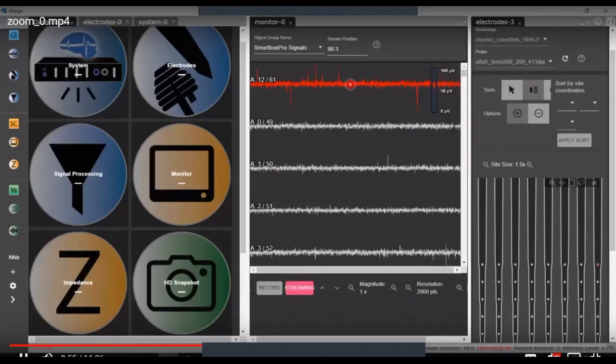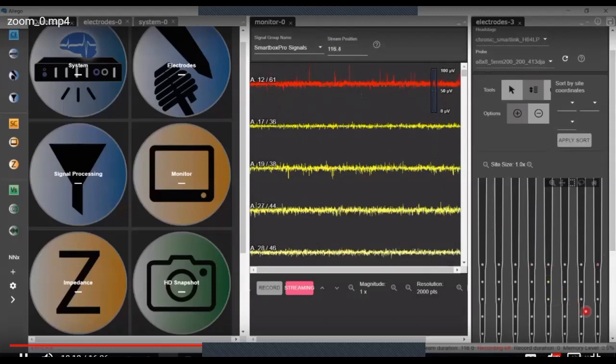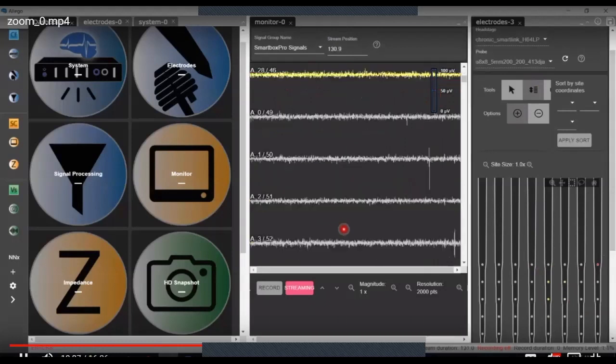When doing these recordings, you can identify a signal of interest, or you can control your map over here by highlighting different groups of channels. And in doing so, while you're recording, you always know exactly which units you're recording and where that location is on the probe that you're recording from. That can be a very valuable tool and one that will let you maximize and get the most out of your experiments.